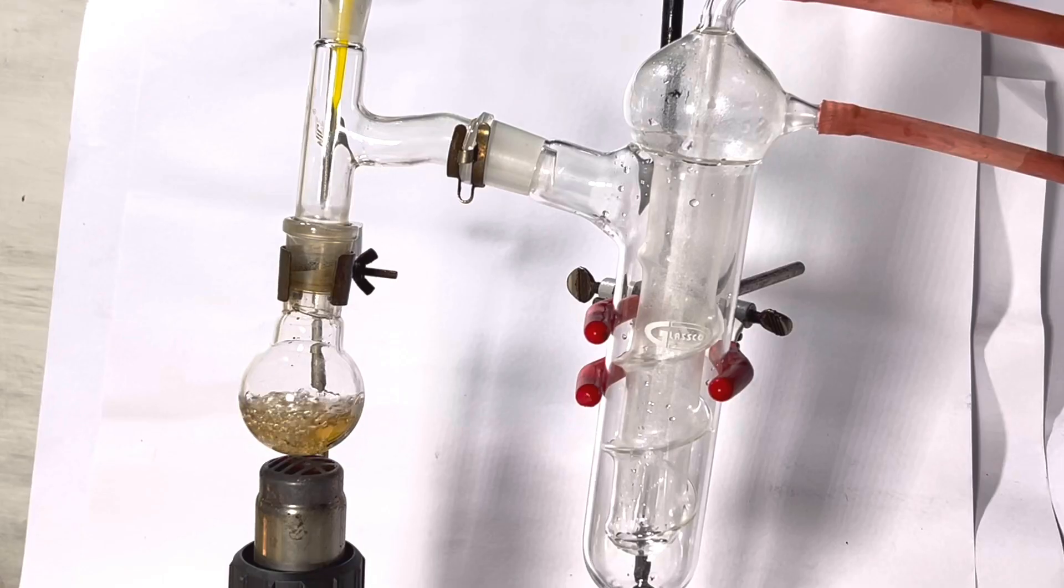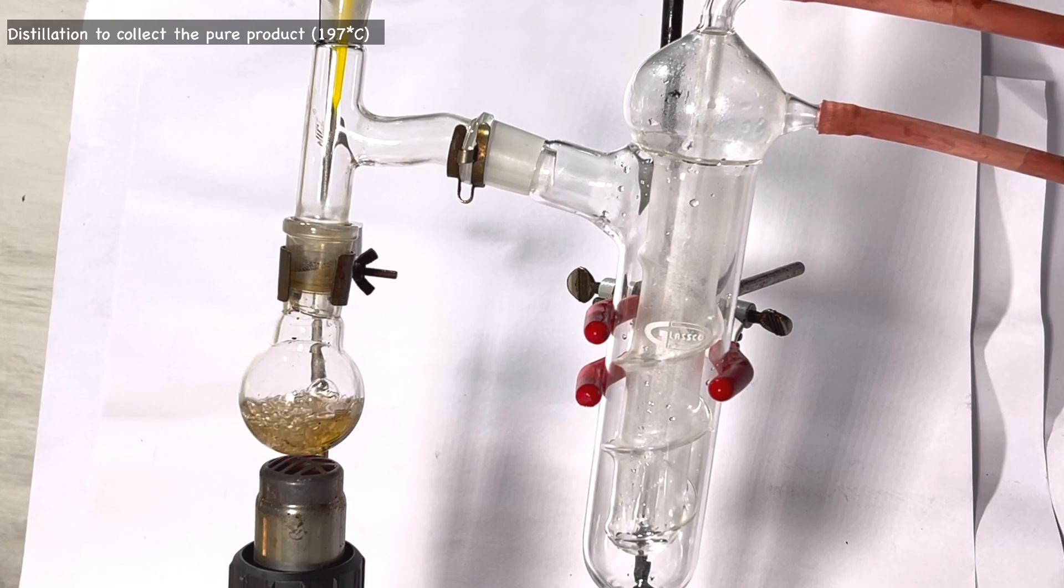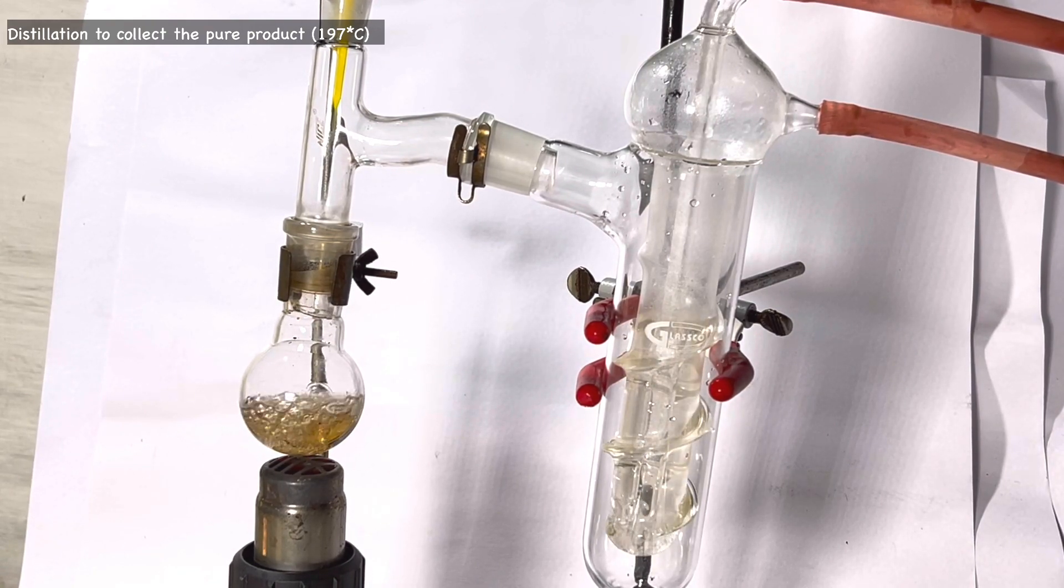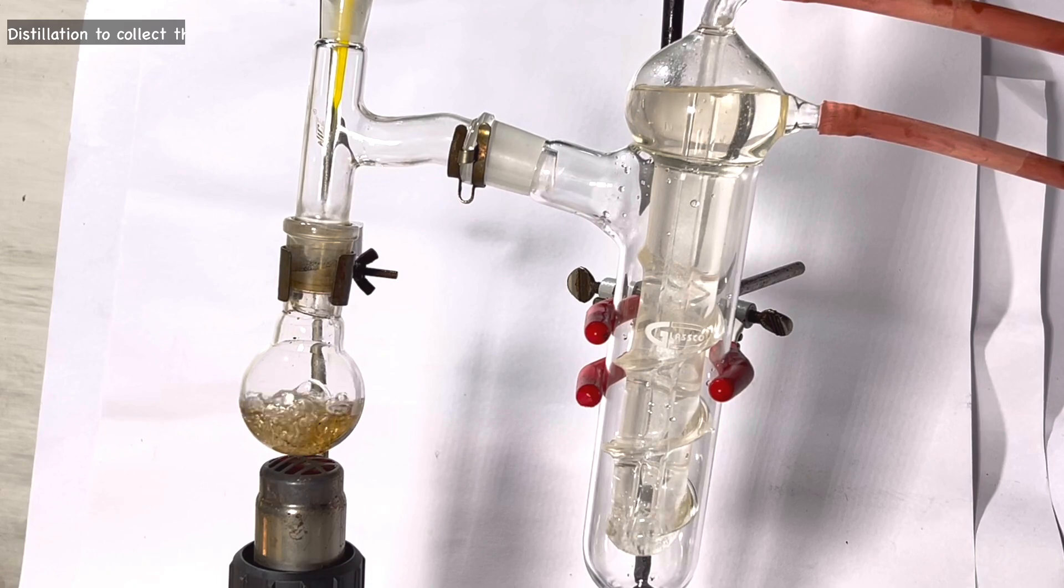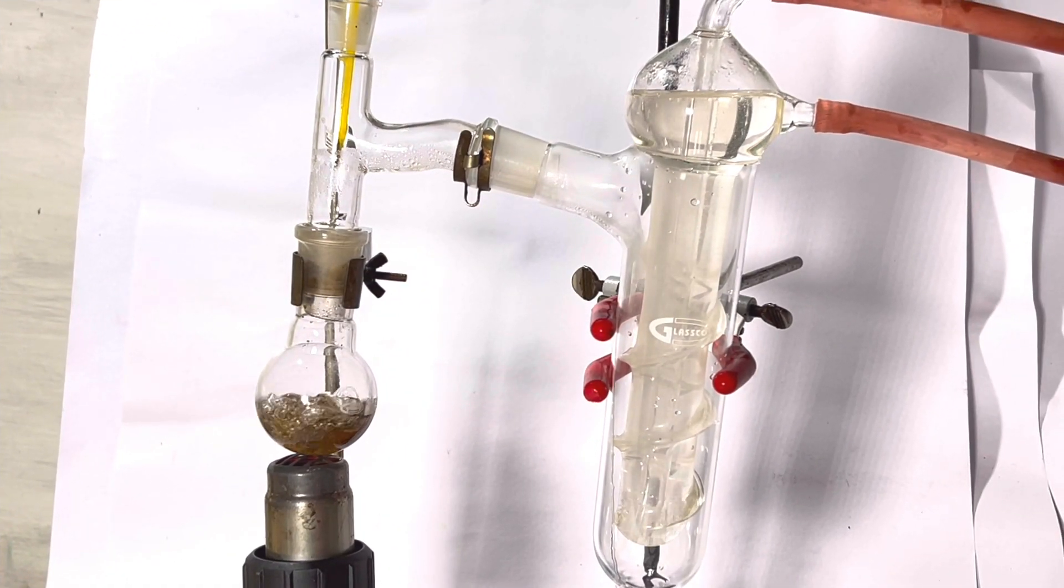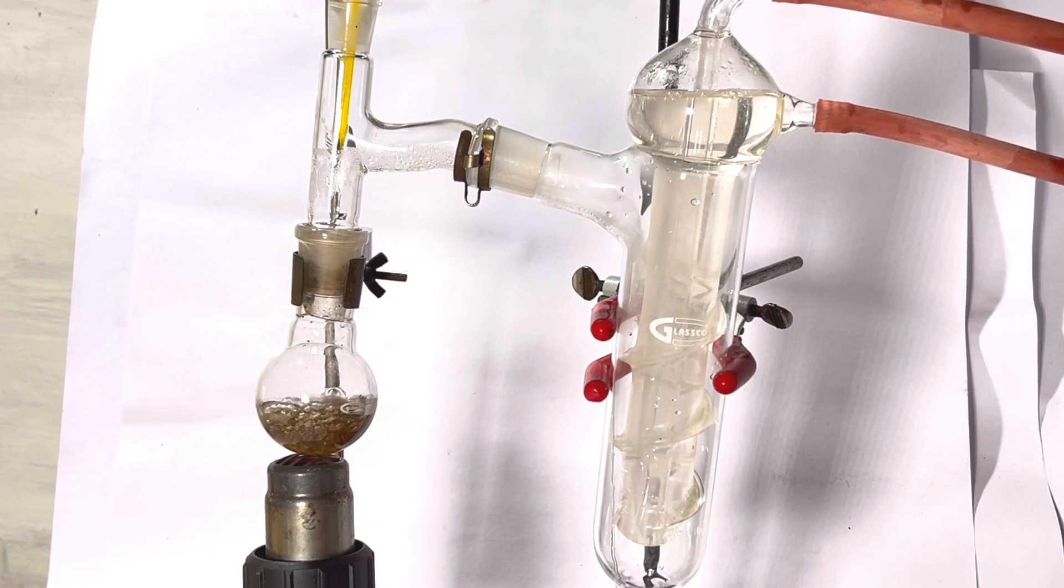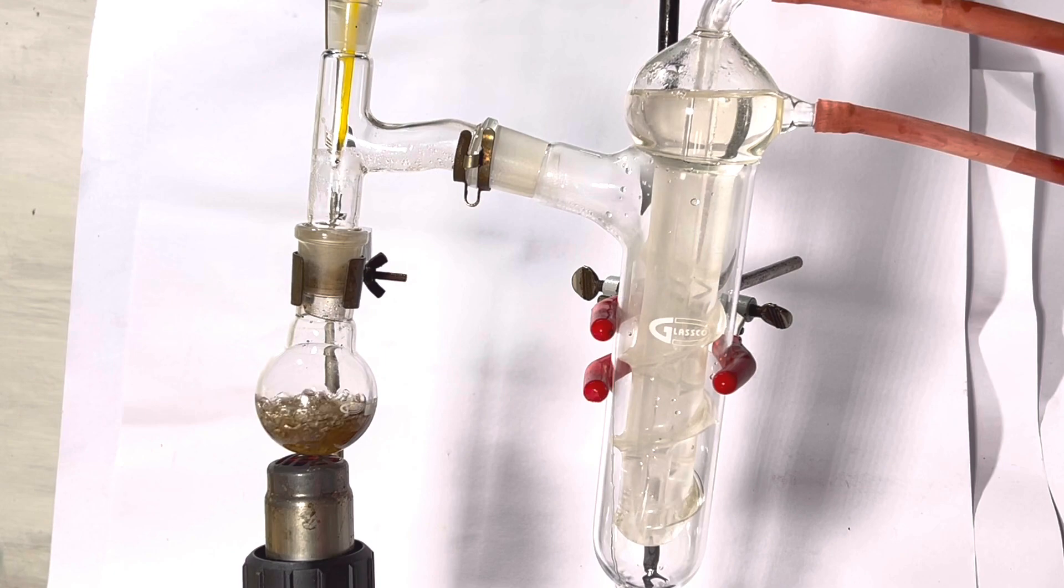Then the organic layer was set up for distillation. A short path distillation is the perfect choice here as the boiling point of 1,4-dibromobutane is 197 degrees C. Since I do not have a short path distillation setup, I am going with the regular simple distillation using the Friedrichs condenser.